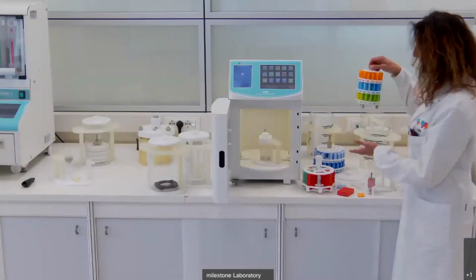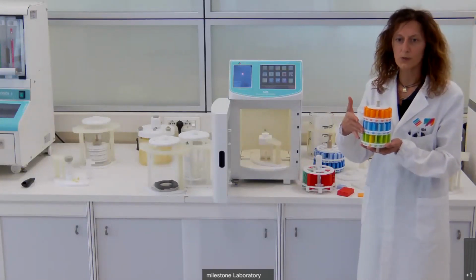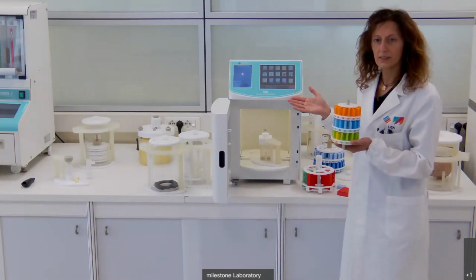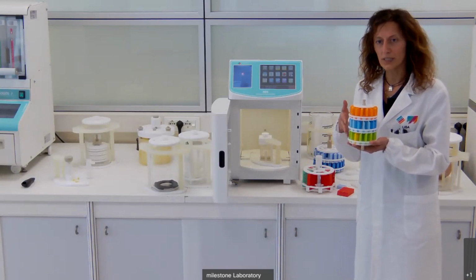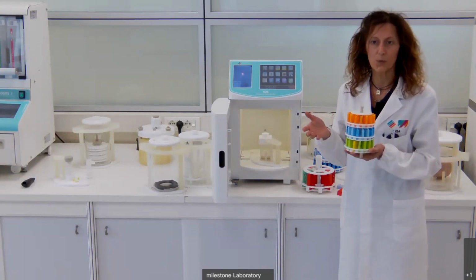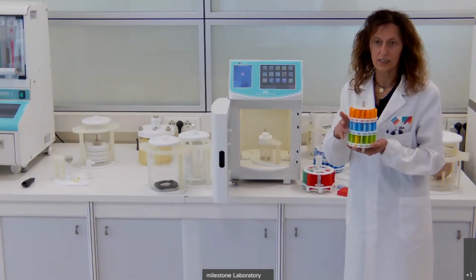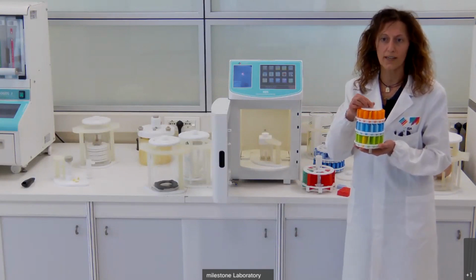If you have, for example, in these batches, sample with 1 millimeter, 2 millimeter, or 3 millimeter of thickness, you have to select on board the protocol for the sample with the maximum thickness. So you have to select, for example, the 3 millimeter protocol. In this way, you can process the entire heterogeneous batch only in one run.